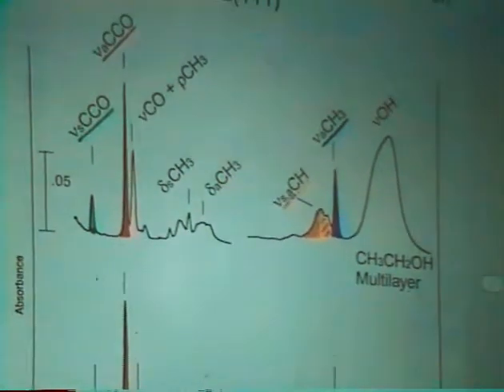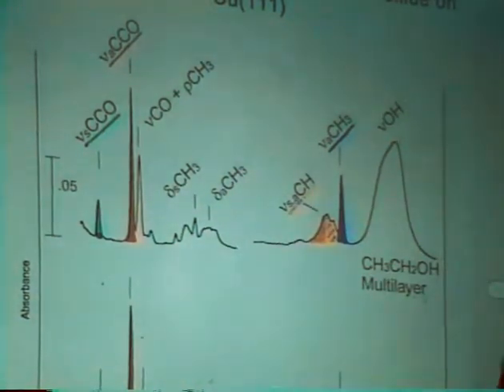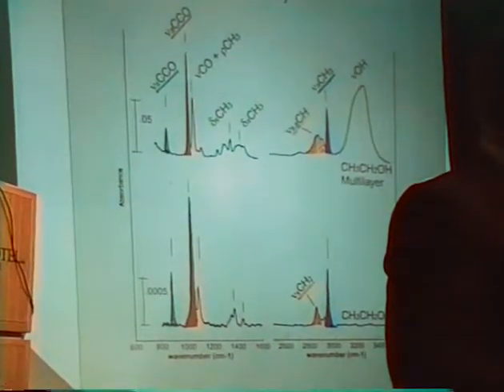In blue, we can identify the asymmetric methyl group stretch. And then below that fairly diffuse region, it does have three maxima in it. That region must contain the symmetric and asymmetric methylene group stretches, as well as the symmetric methyl group stretch.